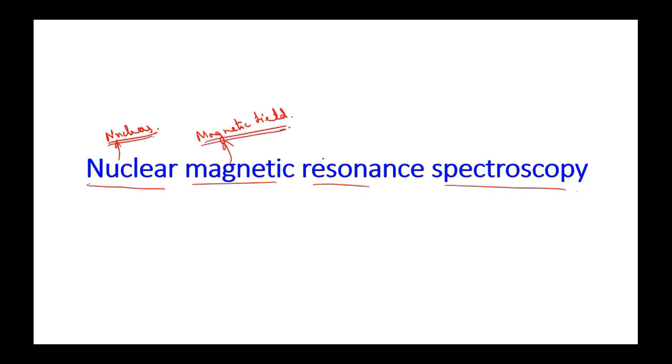And resonance is associated with the frequency of electromagnetic radiations at which there is an increased absorption of the EMR.